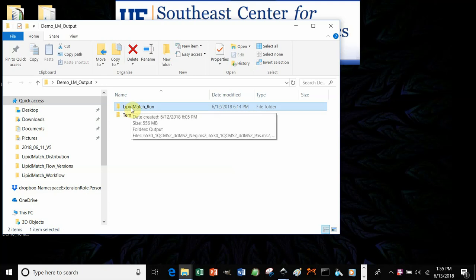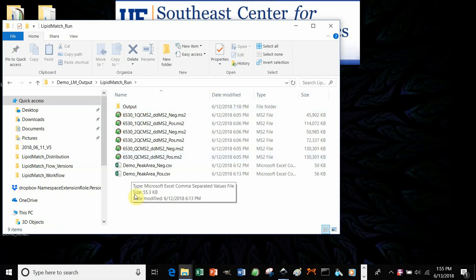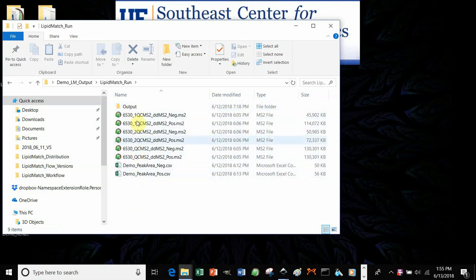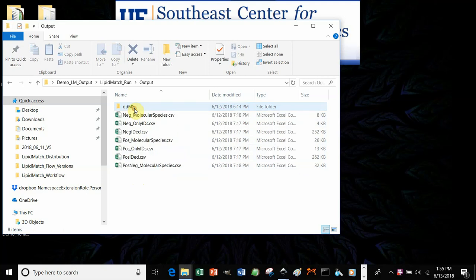In LipidMatchRun, you double-click that folder. You'll see all the converted files, as well as the peak list used for identification. And then you go to output.